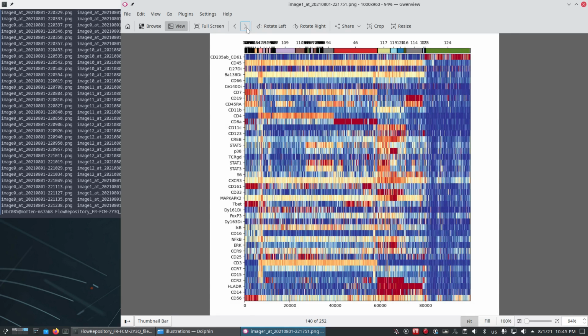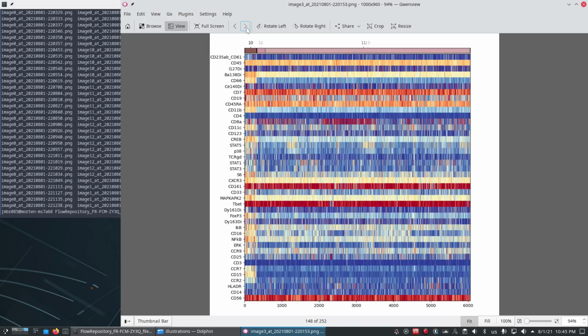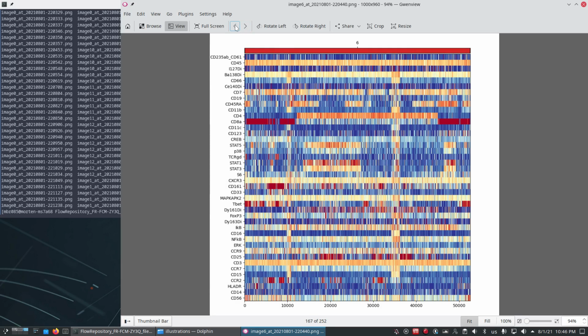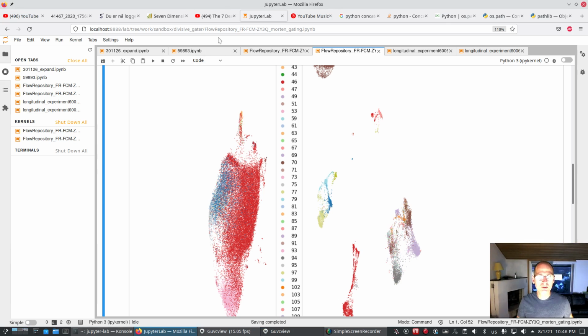And then maybe I have something different for another cluster that I'm splitting, and I have illustrations for that. So every time I set a heat map view, in the other thing, how can I find it?